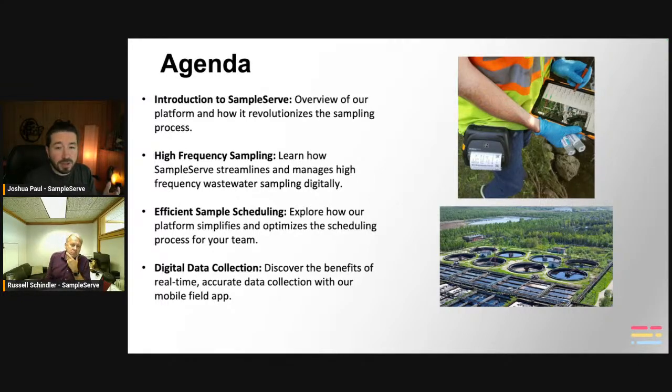Yeah. Talk about the growing need for this and how the current industry is going right now, Russell. Well, obviously every city in the country of any size has a wastewater treatment plant, and with those you've got influent, you've got a process going on, you've got an effluent, and depending on your permit, you've got to test certain parameters. Sometimes just making a visual observation, or documenting a fluid level or flow rates or something. So all that information is constantly being collected.